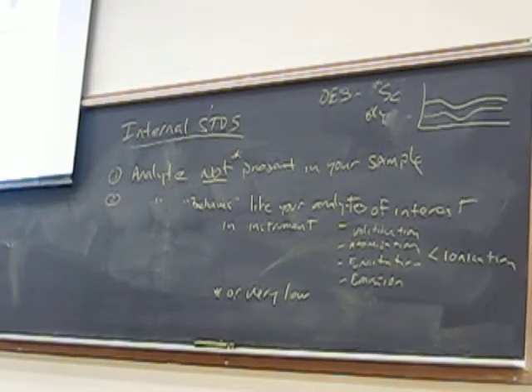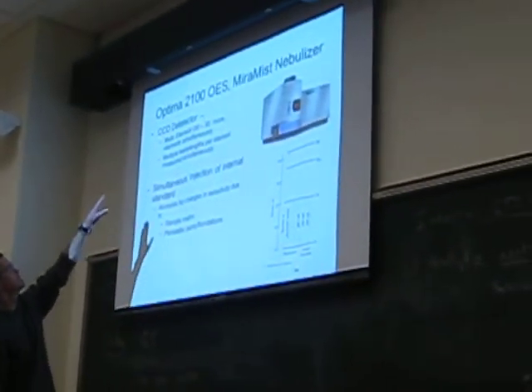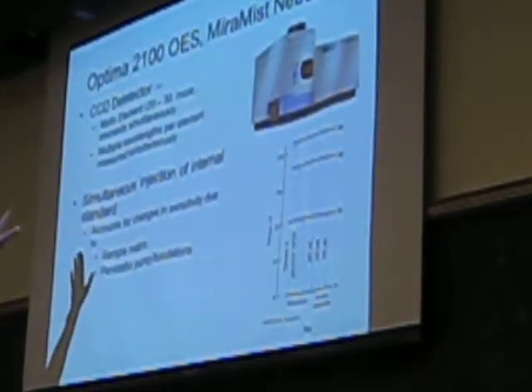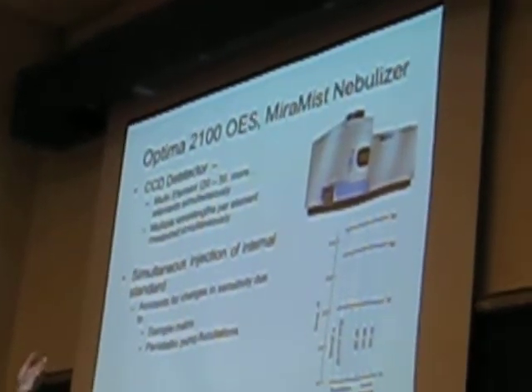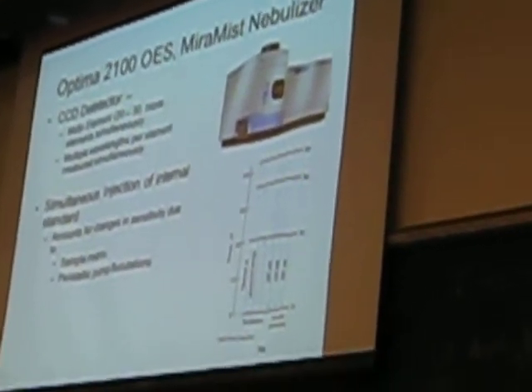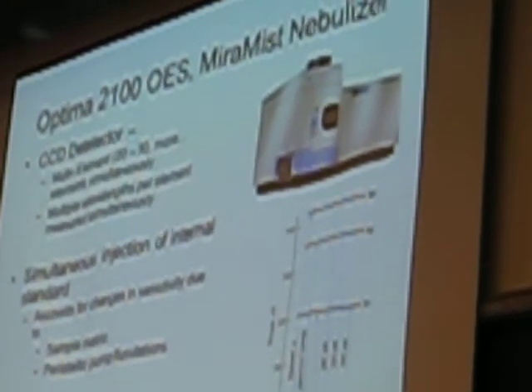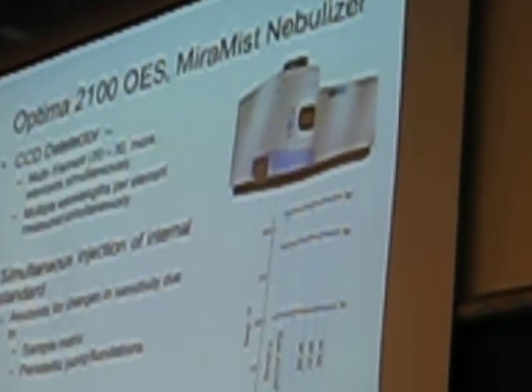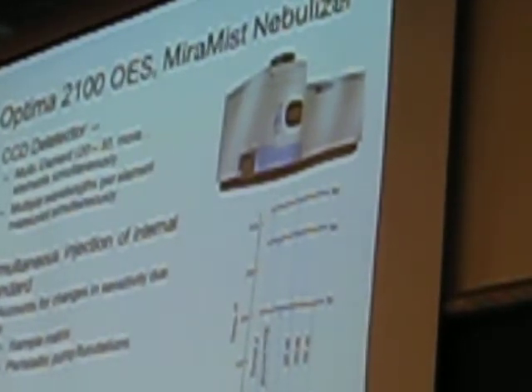Okay, so this is what this thing looks like. The instrument you're going to use, you'll see tomorrow and Thursday, is made by PerkinElmer. I think it's an Optima, blah, blah, blah. And we talked a lot about this, and they market this as commercially a very popular, common kind of instrument because of the analytical capabilities for measuring a host of, nearly not the entire periodic chart, but much of it, right? And the benefit is that you can measure many things at once, which is hugely efficient, especially for those of you who may use Flame AA, where you're going to do things one at a time, right? You can measure many things at once.